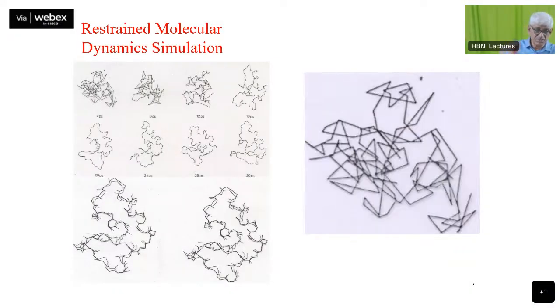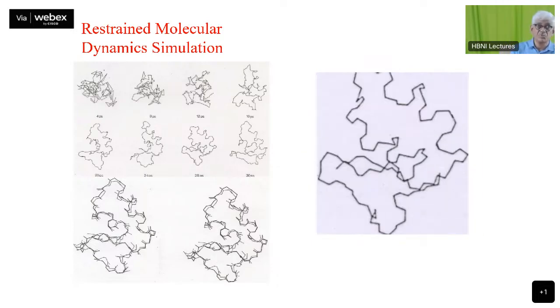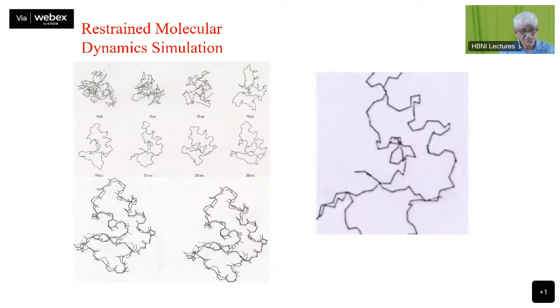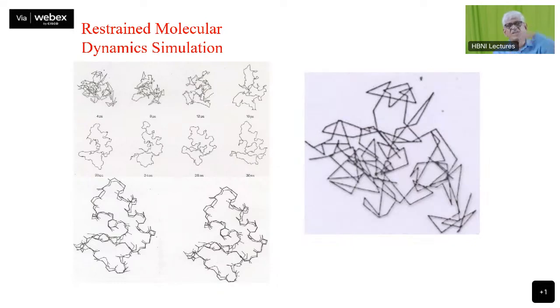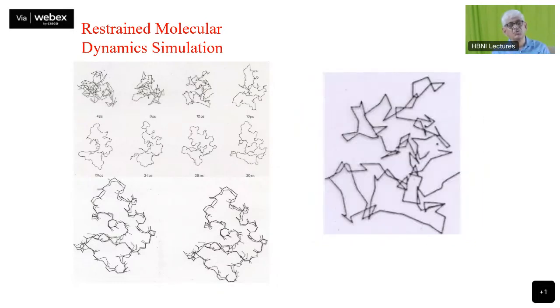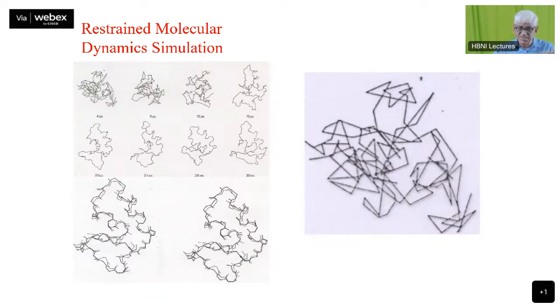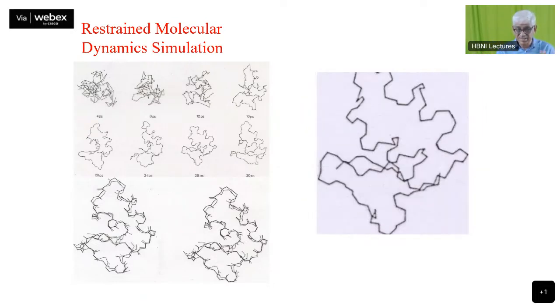Okay, now that was the distance geometry algorithm, but there is another method to obtain the structure, called restrained molecular dynamics simulation. Now what you do here is, you heat up the molecule on your computer to a very large temperature, something like about 2000 degrees Kelvin. What is the purpose? You don't break the bonds. You heat it up so that the chain is completely opened up, completely random, and this completely fluctuates there in the open manner.